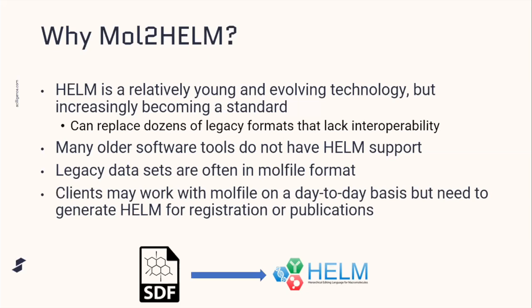And we also have the case where clients may work with molfile on a day-to-day basis, but need to generate HELM for registration in RegMol or for their publications. So people may work with molfile day-to-day because they need to see the atom bond structure, they need to look at individual sections of the molecule, but when they are going to register or when they're writing up a publication, they don't want to publish the entire structure expanded because it's more information than people need.